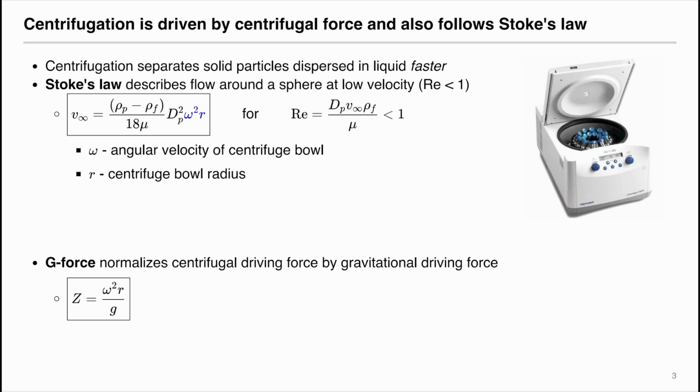Centrifugation uses the driving force of the centrifugal force, and it can also be described by Stoke's law just by replacing the driving force from gravitational force to the angular velocity squared times the centrifuge radius. And the Stoke's law's assumption should also hold so that the Reynolds number is smaller than 1 and the terminal velocity is slow.